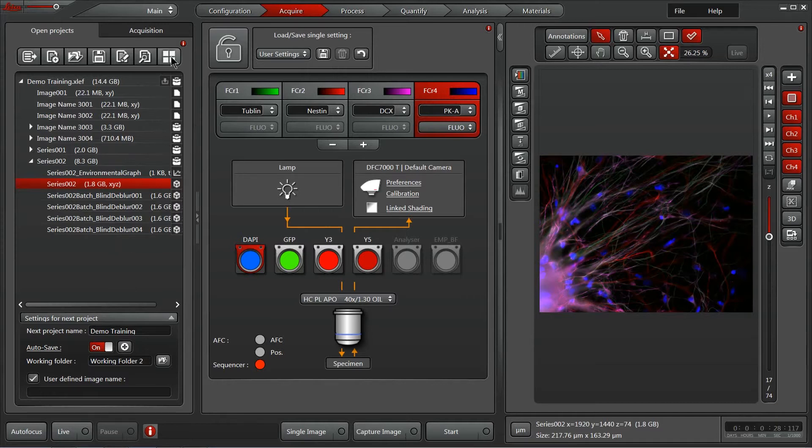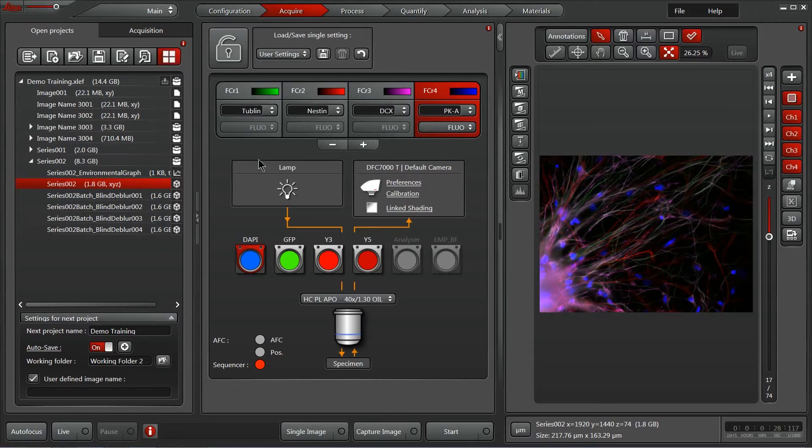This top right button will activate a gallery view, which is a nice quick way of jumping into exactly what image you wanted instead of having to click on each one. You can see them all displayed here together.